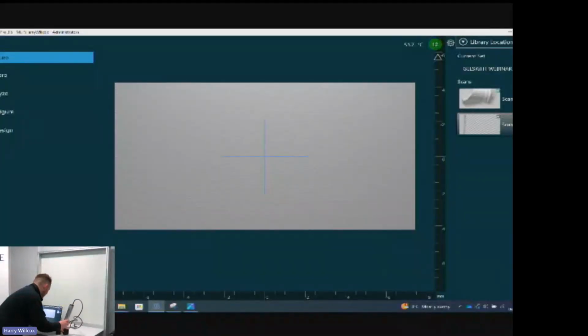But now if I was to take my shiny aluminium component, which I'll bring to the camera so you can see it, a shiny aluminium component which has got a nice step across the surface, you still see the texture. So with regards to the system, one of the main use cases compared to non-contact systems is that we don't have any issue when we're looking at a reflective surface, a transparent surface, or a matte or discolored surface.